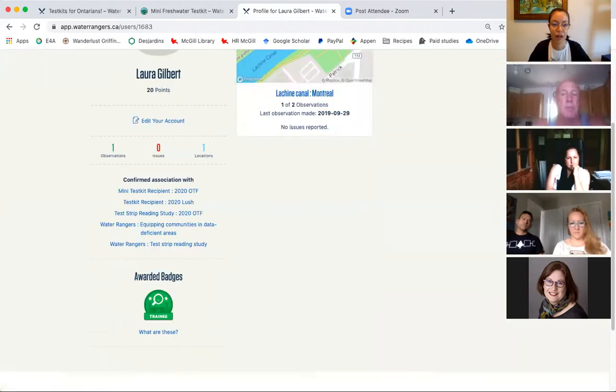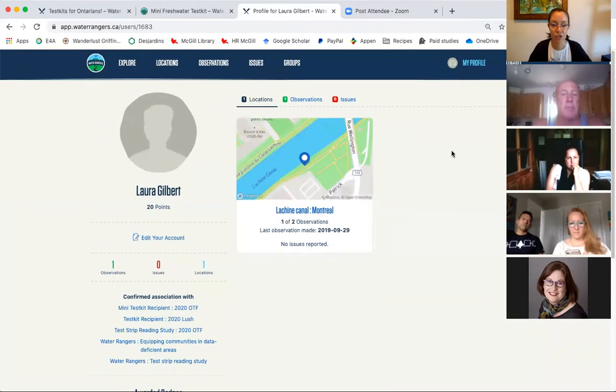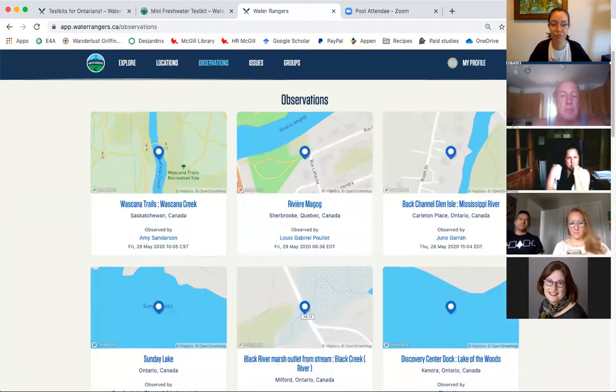Now, if you want to add an observation, I'll show you how to do that on your phone, actually. It's always easier. So I'm going to stop sharing, and I'm just going to show you my phone. We have a phone app for iPhone and Android. And it's just Water Rangers, and you can download it.